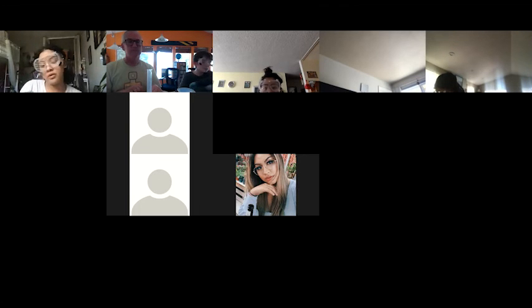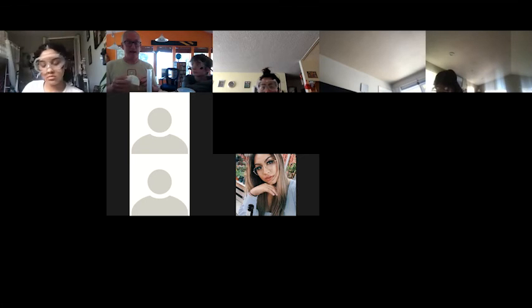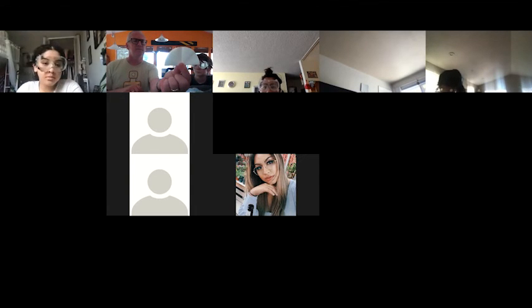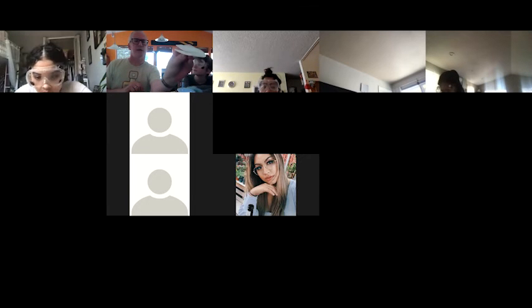And when you prep this, you're supposed to cut this part off? Oh, we don't cut. No, I'll show you how to do that. We'll do that now, actually, because people are probably getting ready to start decanting and washing. So for the filter paper, you just first fold it in half, then fold it in half again so that you've got a quarter. Now there should be 4 layers in there, since we've folded it twice.